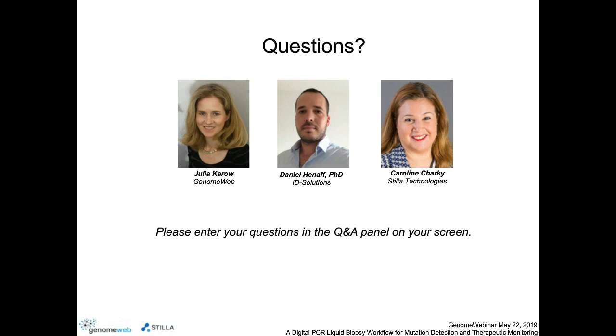Okay, thank you. One more question for Daniel. It's about mutation monitoring, specifically in patients on TKI therapy. So the question is, if you not only look at T790M mutations, how many markers can you detect in one run? And do you have to use one panel or different ones?